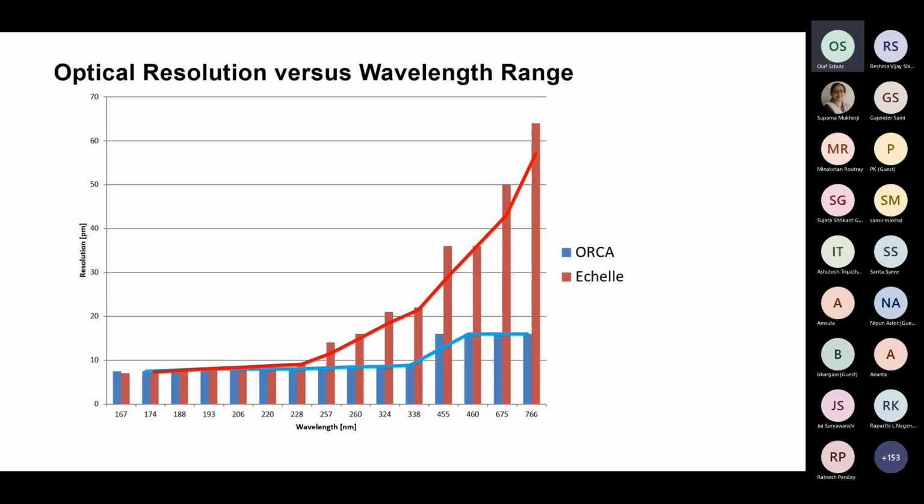With the ORCA, only the first diffraction order is utilized. The resolution is mainly influenced by the focal length of the optical system and the dispersion index of the gratings used. The advantage here, also in the wavelength range above 250 nanometers, is that the optical resolution is high, line interferences are reduced, and the overall accuracy is improved since corrections are required to a much, much lower extent.